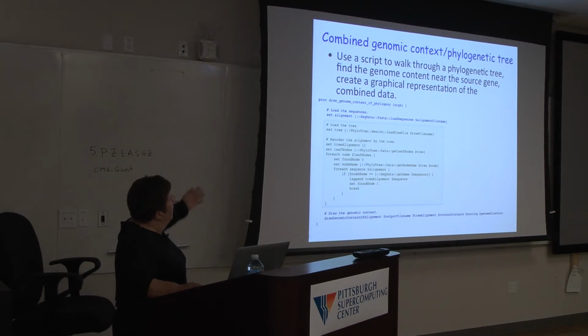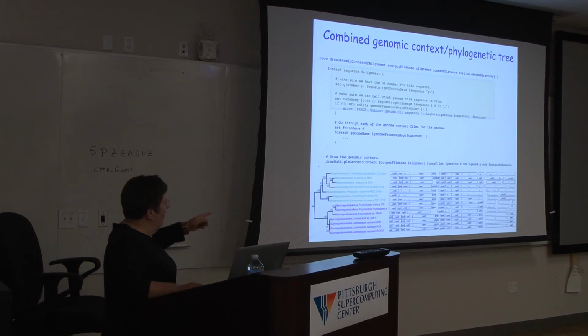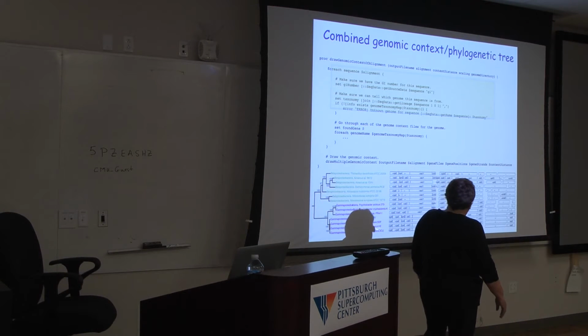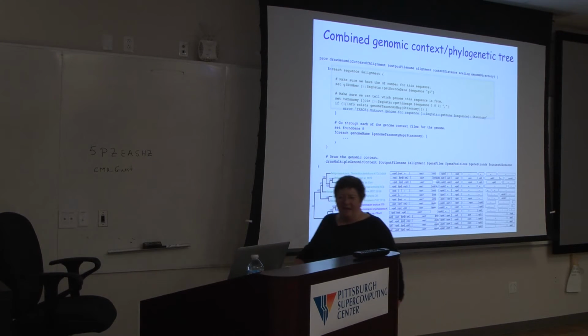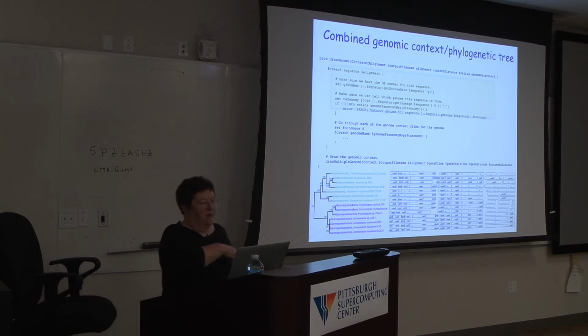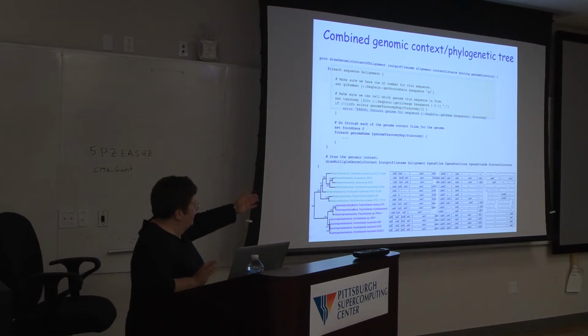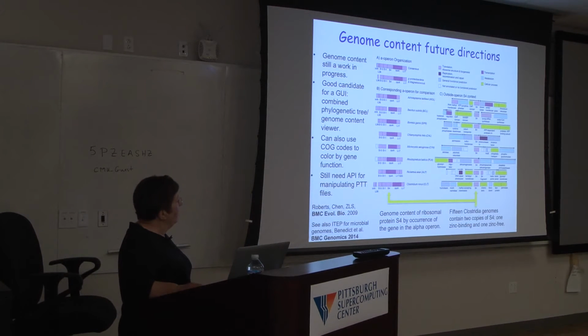So you write some code that brings in the genomic sequence, and then so many nucleotides to the left and to the right of that. Make a tree, but make a tree just on the one protein there, that S4 that I put an arrow by. And of course, life is never that easy, right? So S4 in the genes is known as RPSD. So that's why you also need that list that tells you that's just another synonym for what the protein chemist calls S4 and the geneticist calls RPSD, right? So that's what we're now looking at, and then you can go color it.